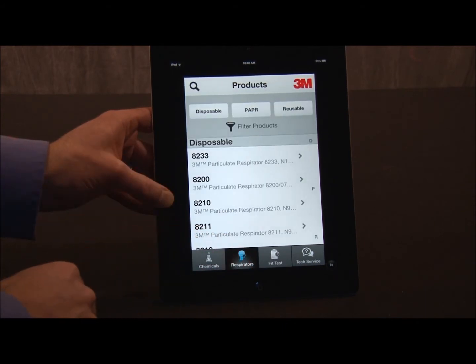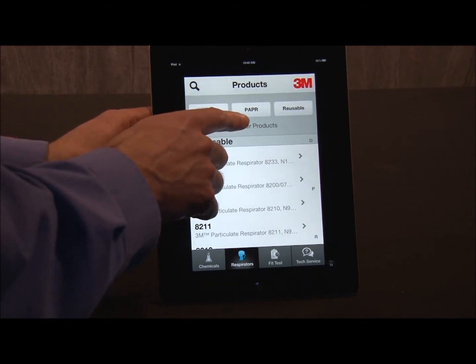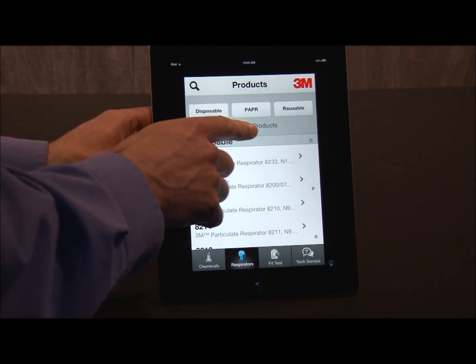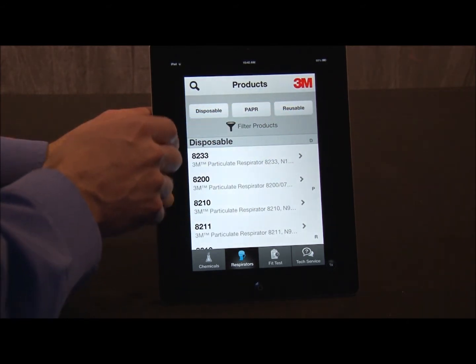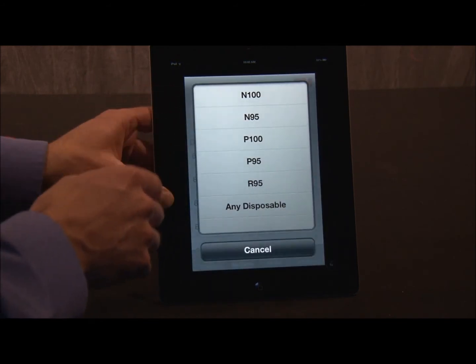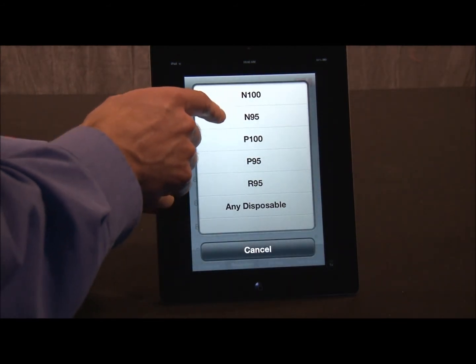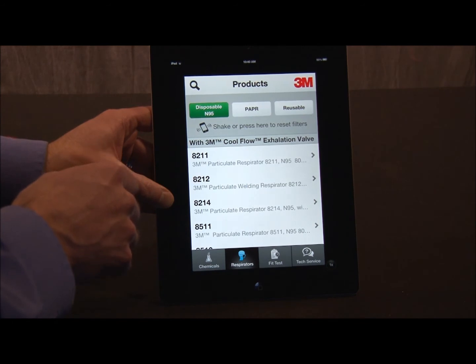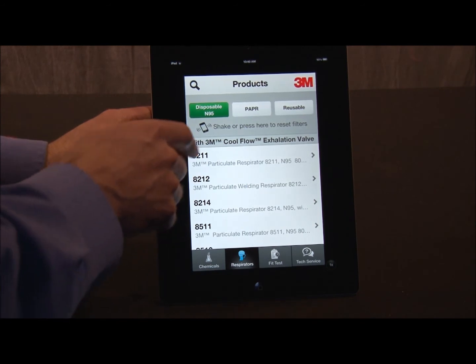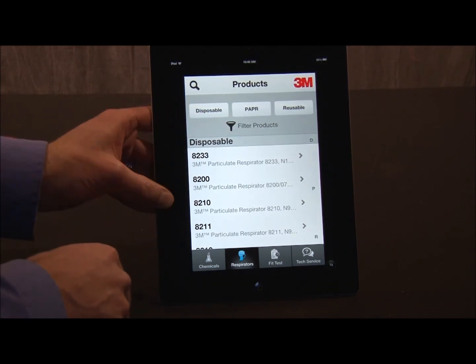Next, we'll go to respirators. I see that there's information about disposable respirators, powered air-purifying respirators, and reusable respirators. For example, I can go to disposable and search by N95 respirators. To clear this, I can either shake it or just hit this button right here — it will clear out the filter.